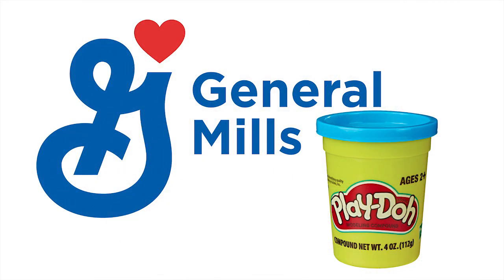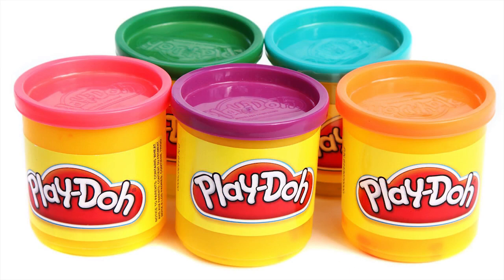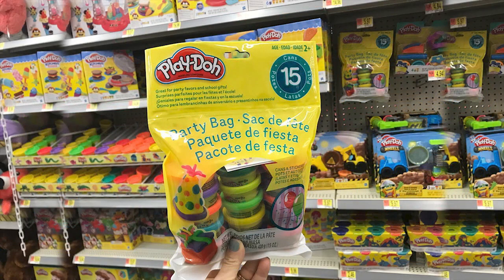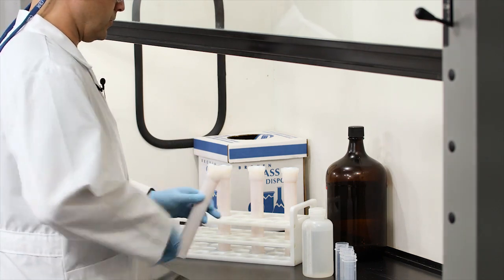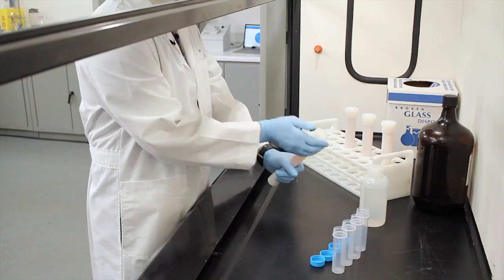General Mills bought the company and all rights to Play-Doh in 1965. After a few additional name changes, Hasbro purchased the Play-Doh franchise in 1991 and continues to market and sell the product. Today, more than 6,000 stores worldwide carry Play-Doh. So what's your favorite color? CEM blue, of course. Now that our vessels are cool, we can vent them in the hood and perform our dilutions.